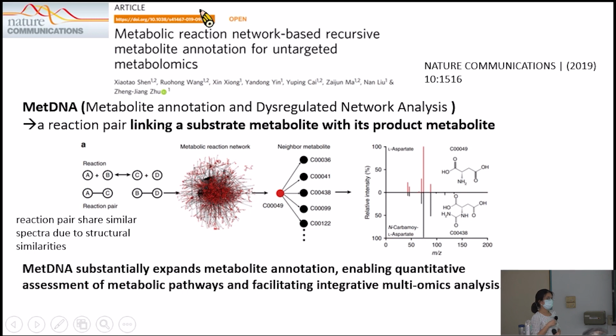For example, the right-hand side shows a chemical compound, because I can see its structure, but it gives several peaks. So I don't know why this single chemical compound can give multiple peaks. If you are talking about a spectrum of metabolism, which is a collection of several metabolites, I can understand why that kind of data can give multiple peaks, but I don't understand this case.